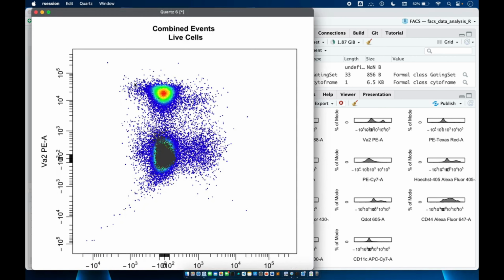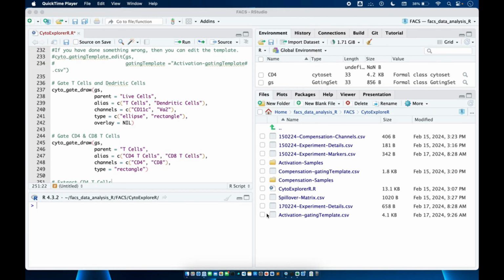First we have to do the T cells. These are the T cells. You have to click on 4 different points: point number 1, point number 2, point number 3, and point number 4. It will tell you the T cell population. This is how you can draw the ellipsoid, by clicking 4 different points. T cells is 34.59, and the next is dendritic cells, for which you can use a rectangle. Click here and this point, and it will tell you the dendritic cells. The percentage is 7.31%. We have seen that CytoGateDraw has support for mixed gate populations, that is ellipsoid and rectangle.